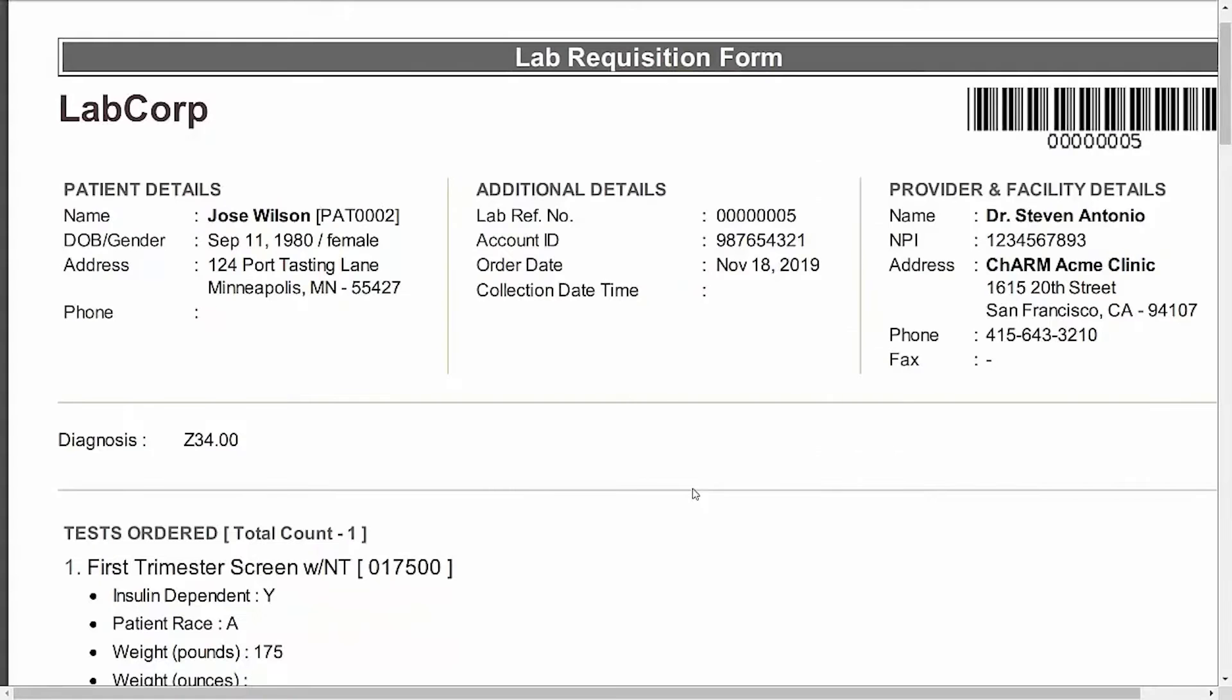Lab order contains complete details of test orders, AOE, diagnosis details, billing details, and LabCorp specific barcodes.